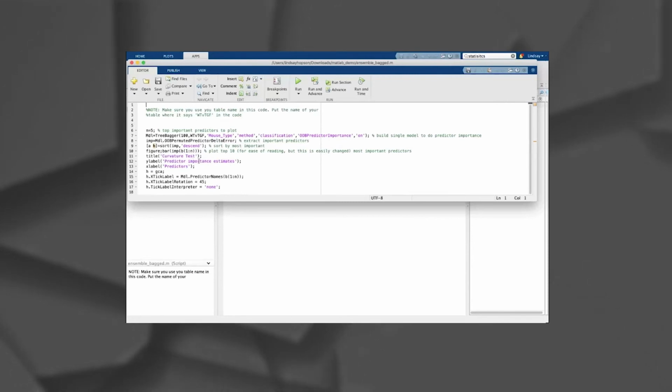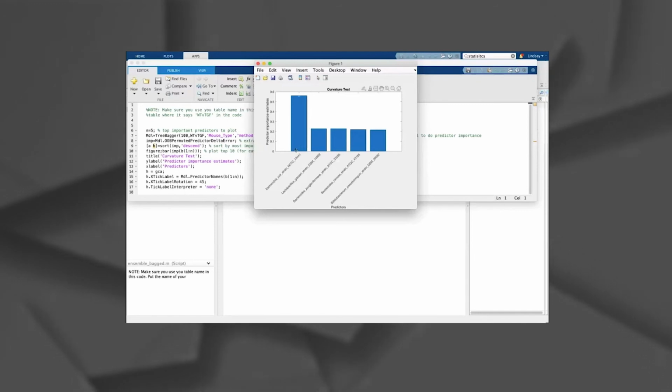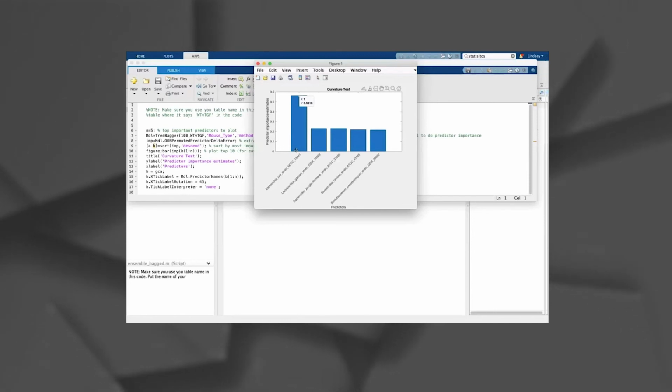And so we're going to run this code. You can either run it by just double clicking the code, and then it'll pop up. You can select run, and it'll run, and it'll produce the important predictors plot. And here it shows that E. coli strain NCTC 13441 is the most important predictor for differentiating between wild type and TGF beta deficient mice.